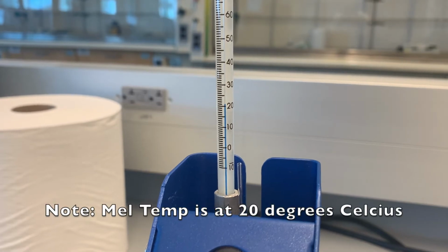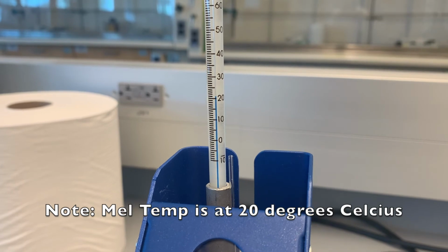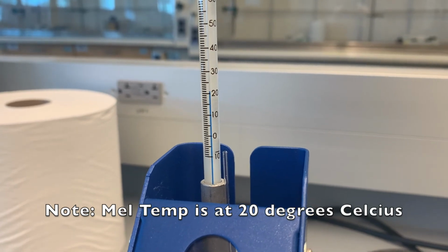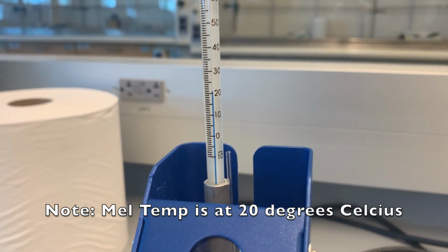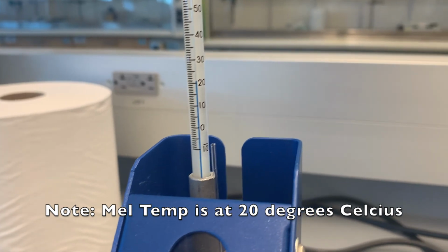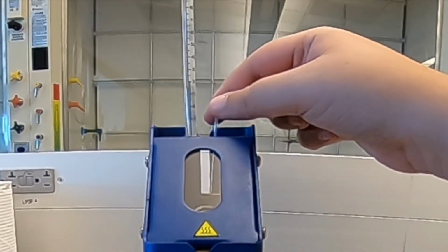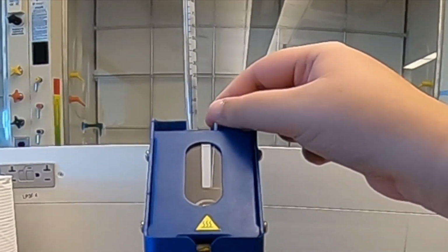Before you touch anything, be sure to examine the temperature. The Mel Temp itself can be hot, and we don't want anyone getting burned. We also check the temperature to ensure that it is below 20 degrees prior to adding our capillary tube. If not, you should wait. After checking the temperature, we can place our loaded tube into one of the 3 slots.